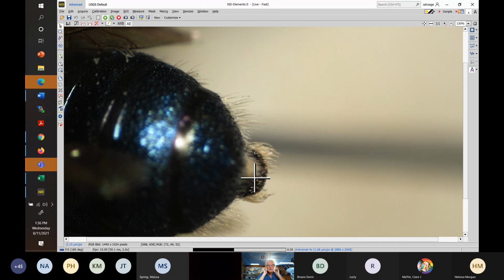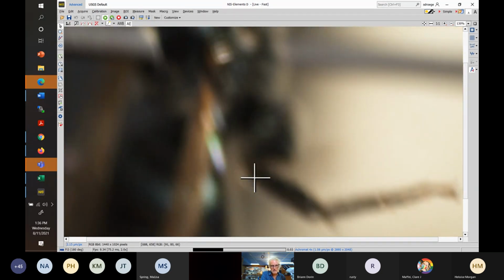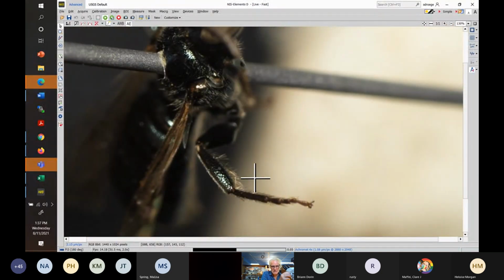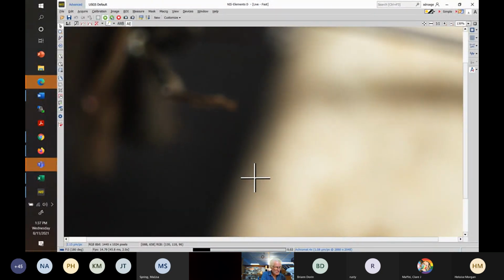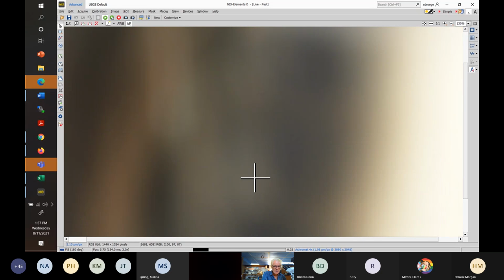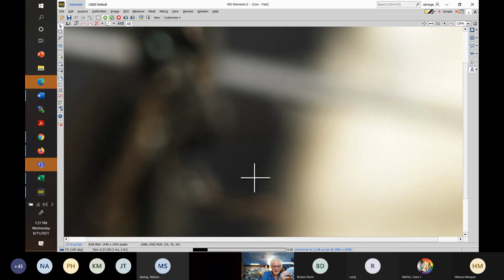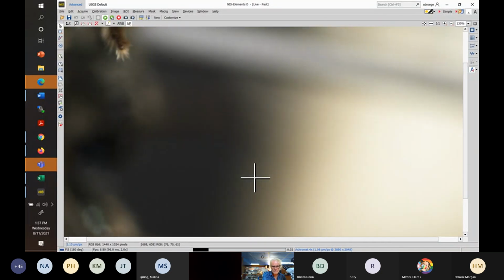Okay, so thinking about that, that's not actually terribly useful, right? We know it's not strenua, but we would know that anyway. Let's see if I can find the femur, which I can this time, a little bit easier. I'm going to bend it for a better view and zoom in. So the femur characters here, what I like to use, there's a couple other subtle but very difficult to pick out characters on the femur.